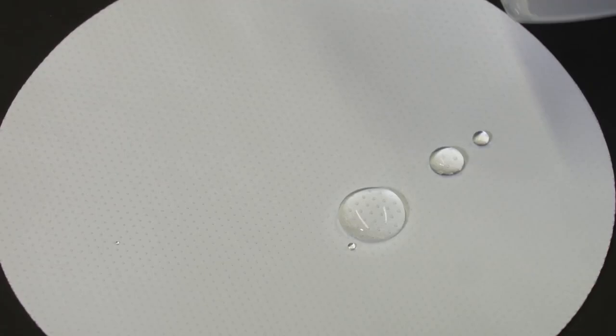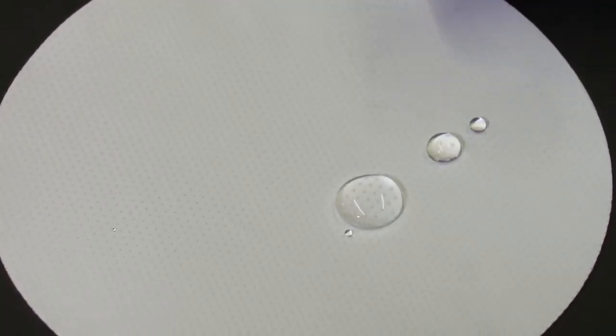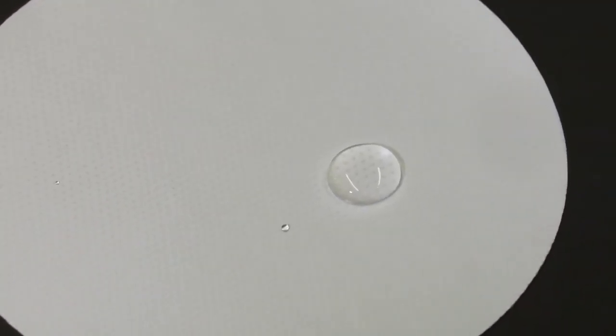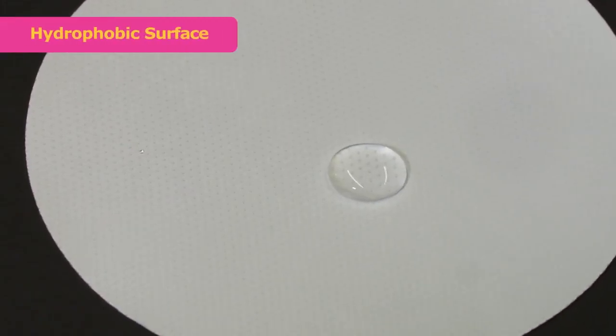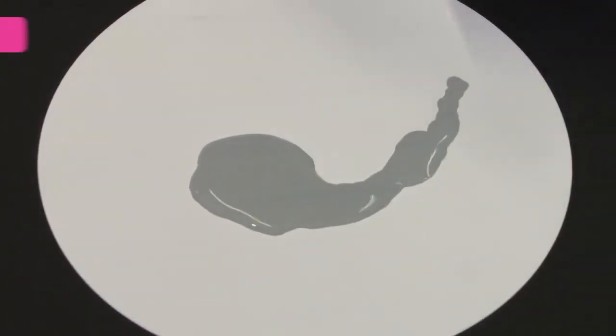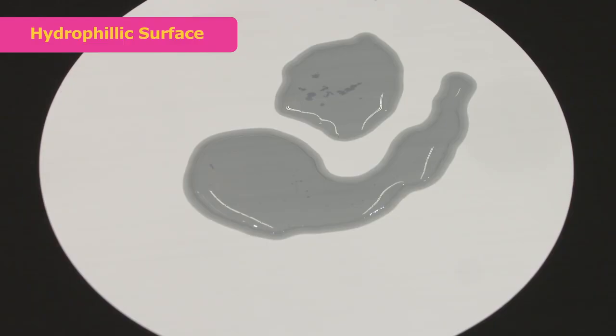The interaction between liquid and contact surface can be seen by putting water on different membrane types. We've seen that water beads up dramatically on the hydrophobic membrane made of the polymer PTFE. The water beads up because it's trying to minimize its contact with the hydrophobic surface. When I put water on a hydrophilic membrane, in this case, a modified PVDF, the water absorbs easily because there is a strong attractive force between water and polymer.